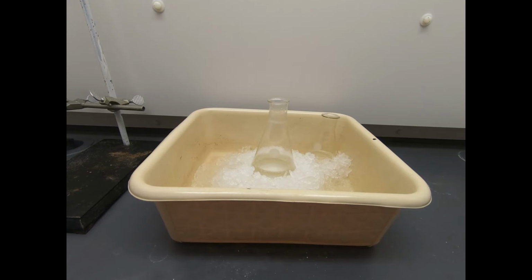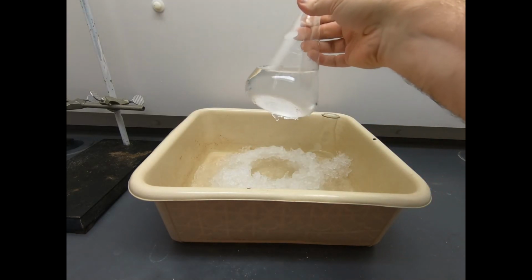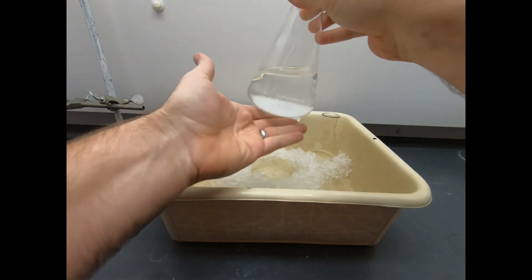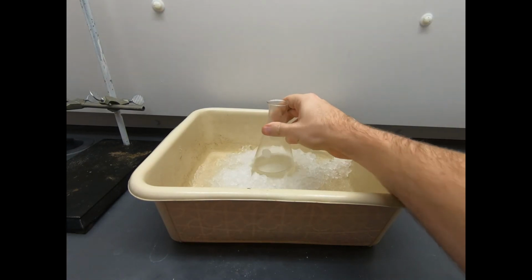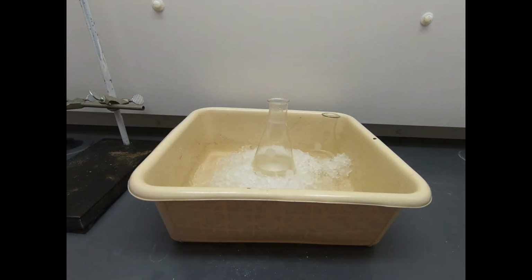Okay, we've been cooling now for a good half hour. And you can see there is solid, and that's not ice on the bottom, that is solid on the bottom. And that looks promising. I don't know if it's 100% of the way done, but we'll give it a few more minutes on its own while we do some other work, but that's good to see.